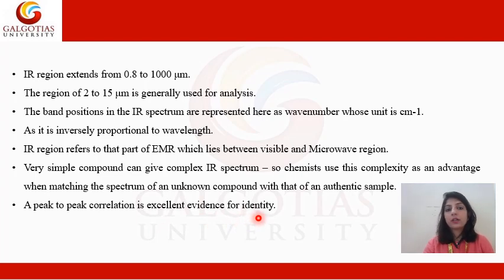For this, you can go for your peak-to-peak correlation, whether this particular peak is present in this compound or not. So you can go for your peak-to-peak correlation.